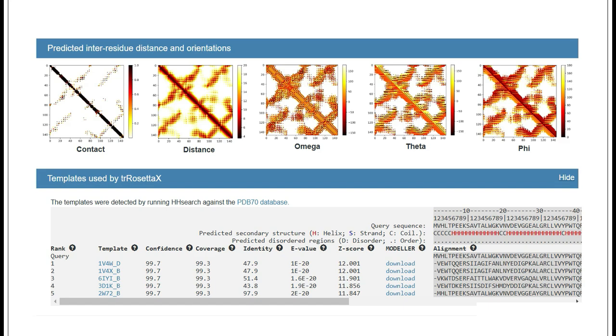The axes represent the residue numbers, and each point on the map corresponds to a pair of residues. The color intensity from light to dark red indicates how strong the contact prediction is. Darker color suggests stronger confidence in the residues being in close proximity. This map is critical for understanding the overall folding of the protein.